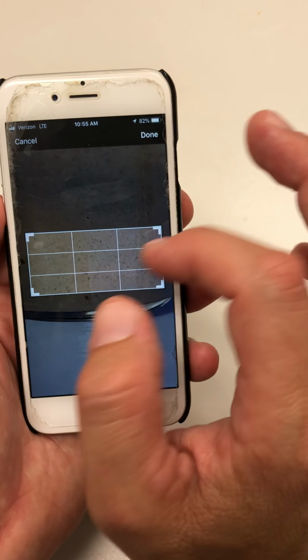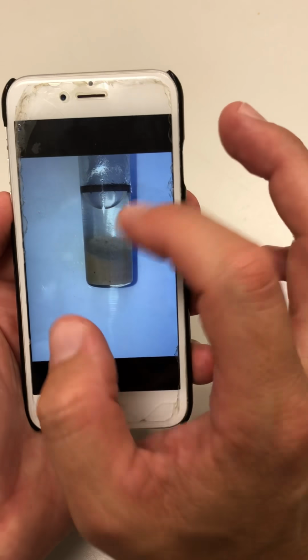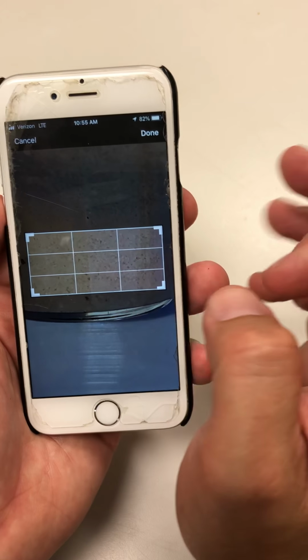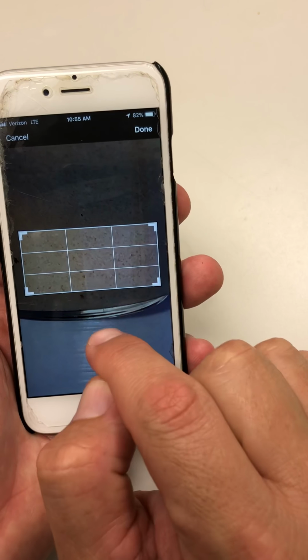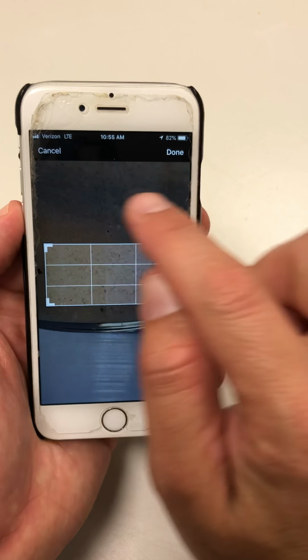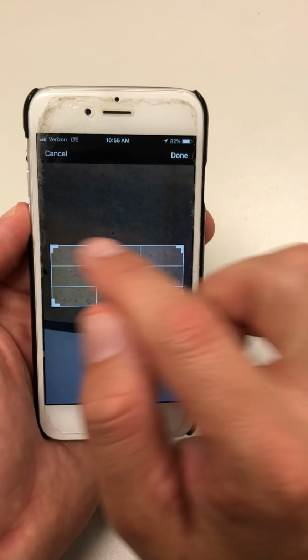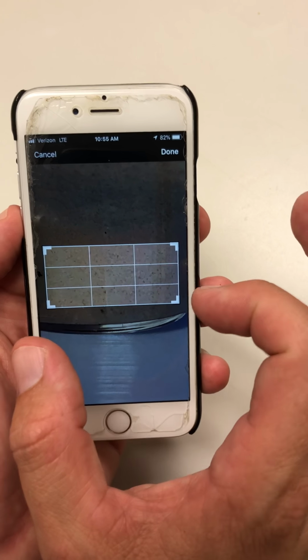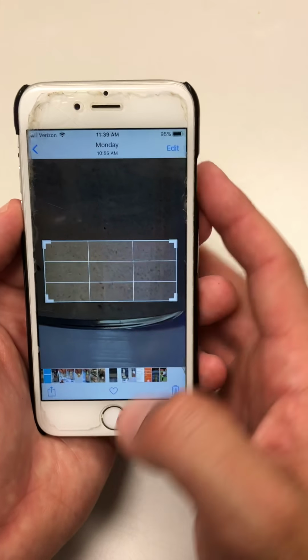And over here, I want to show you from that particular photo, when we did our crop, this is the grid. Notice the grid that I'm talking about, the cropping grid. Notice that we came inside the bottom, and from the right and left edges of the test tube, we brought it in. And here's that accumulated catalyst I was talking about that's uneven up there. We brought it down from there. So we got a nice cropped area here that we want to use for our calculation.